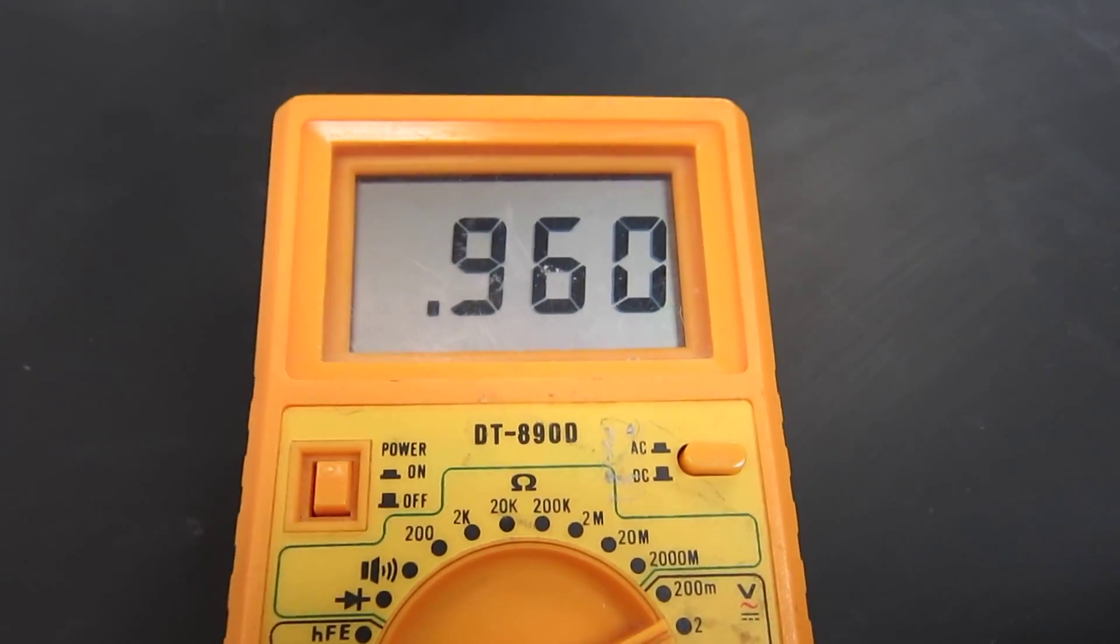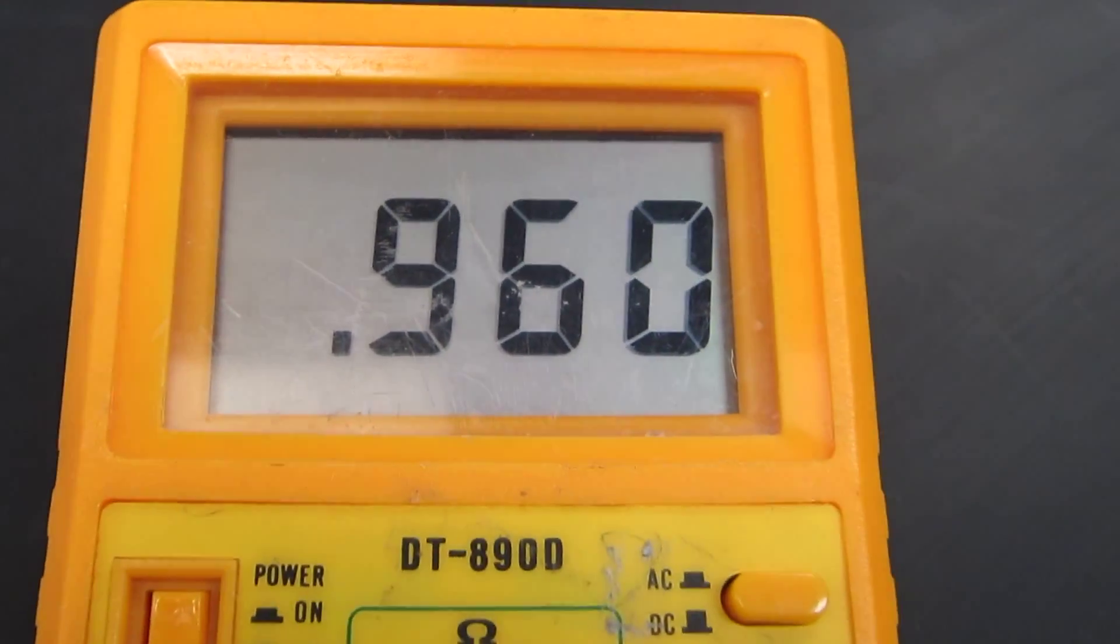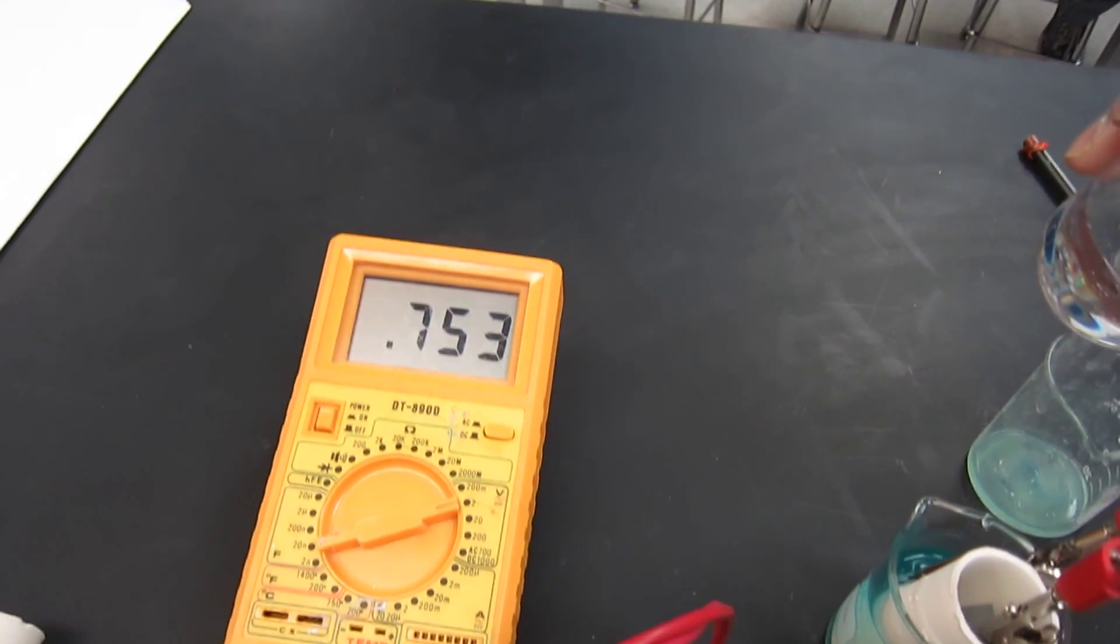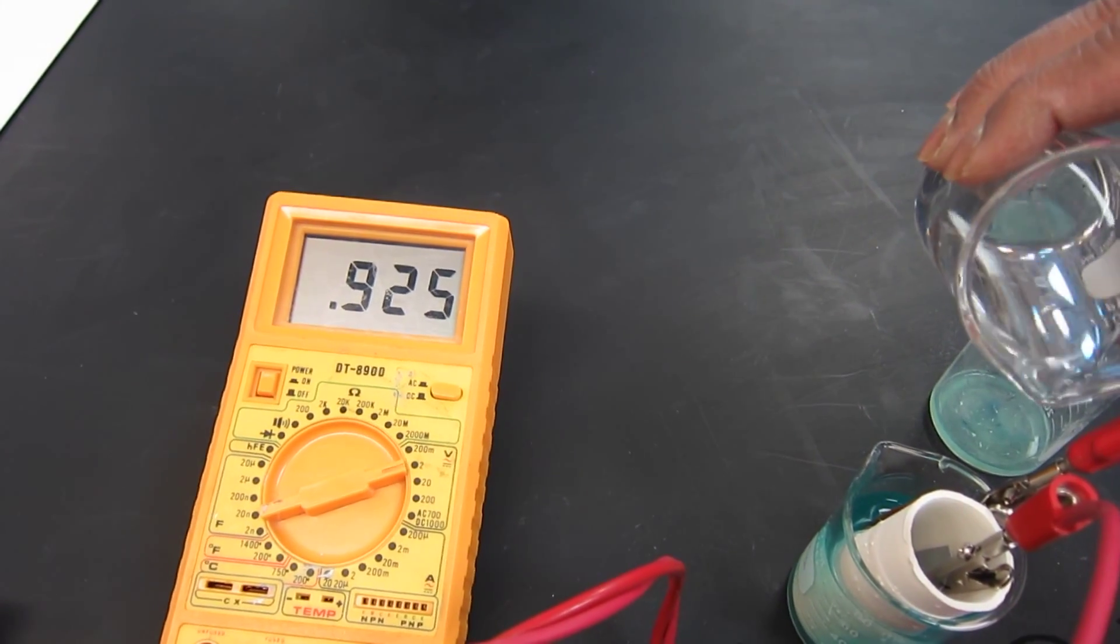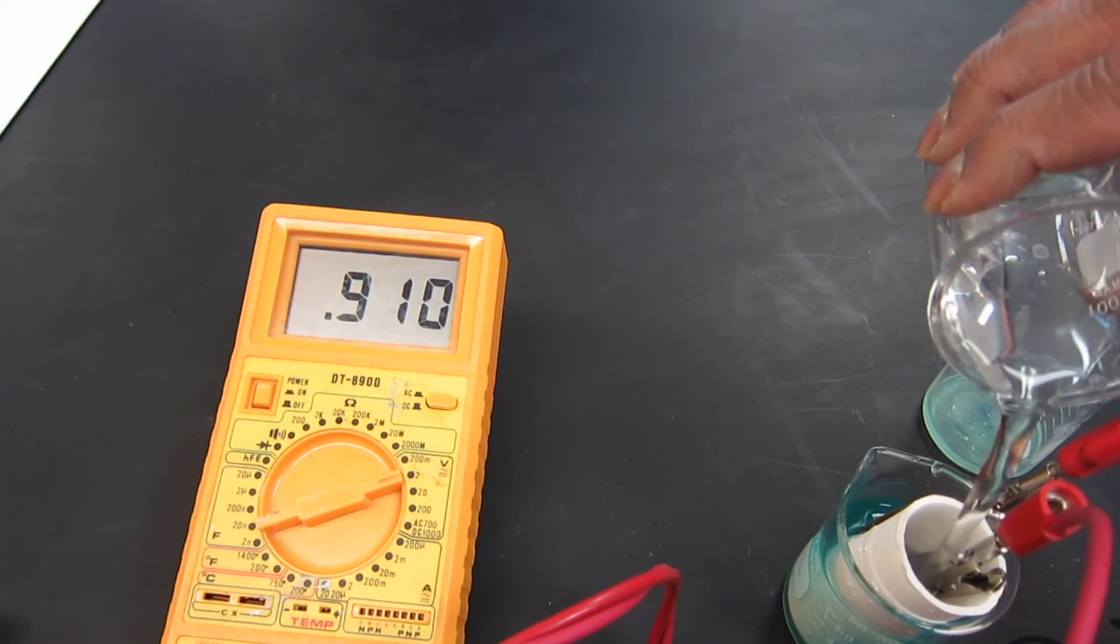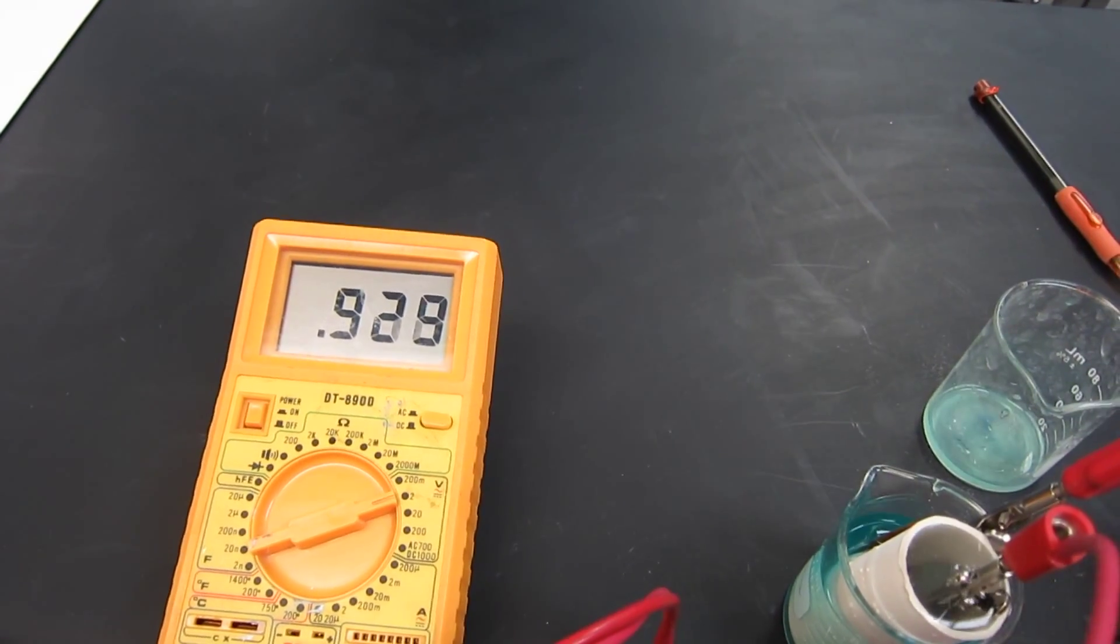First take the reading of 1 molar concentration copper sulfate with 1 molar concentration zinc sulfate. Record the value. Repeat the process until you have taken the readings for all 5 concentrations.